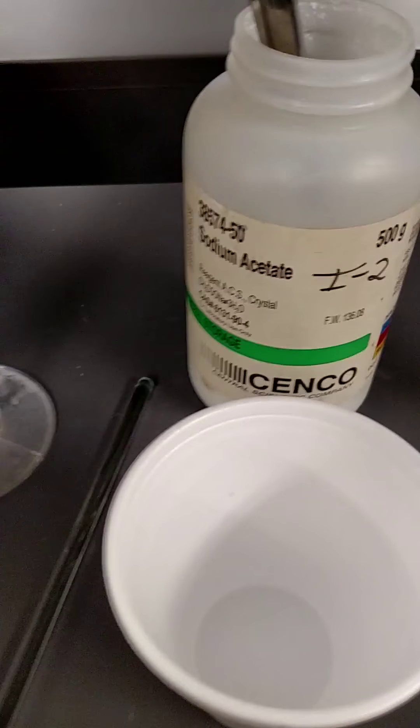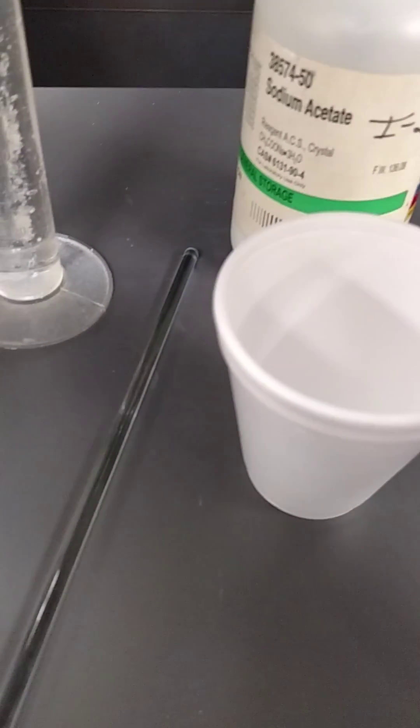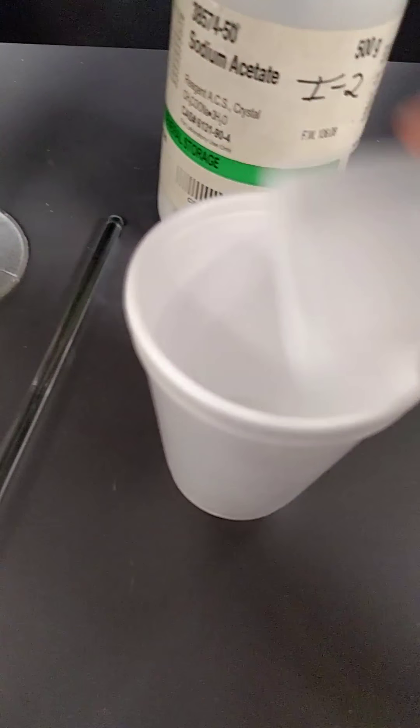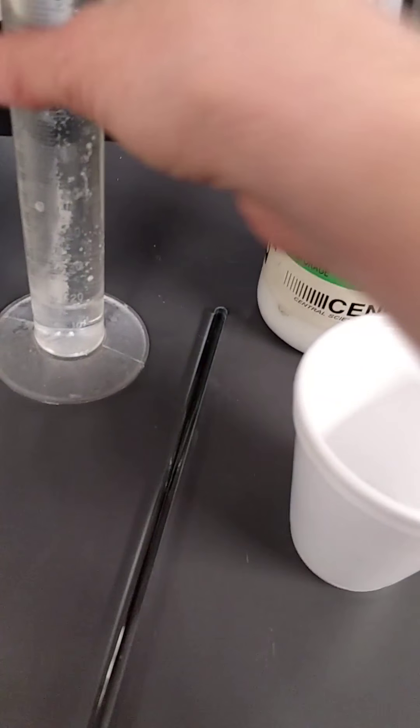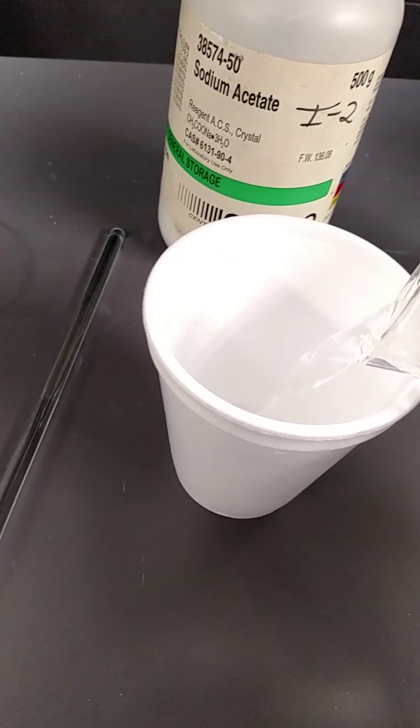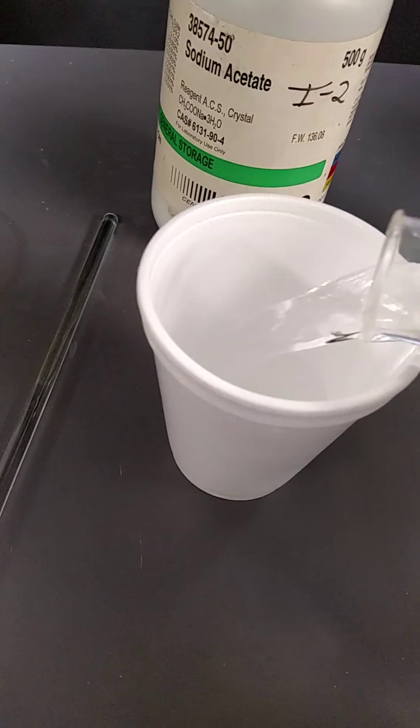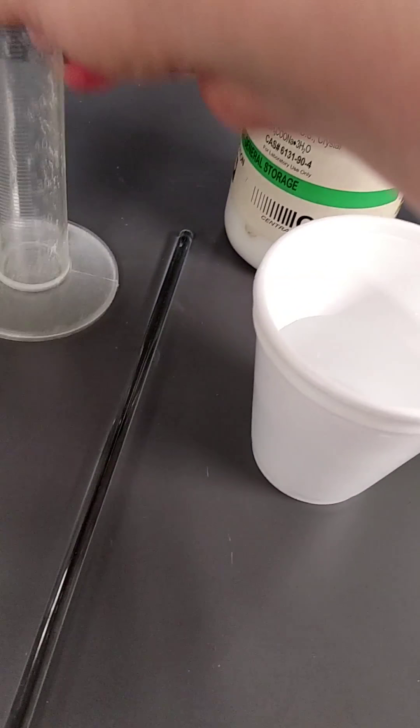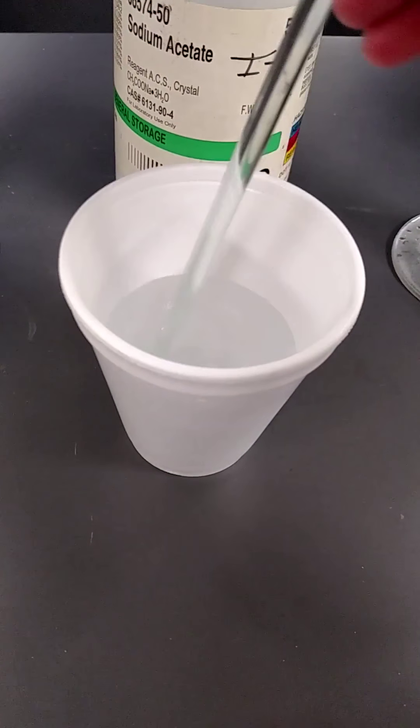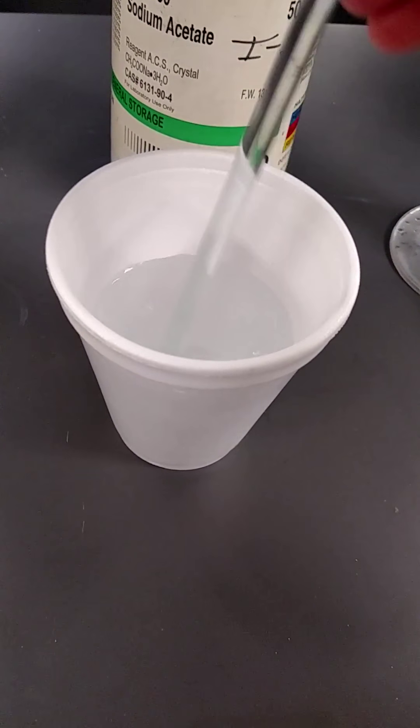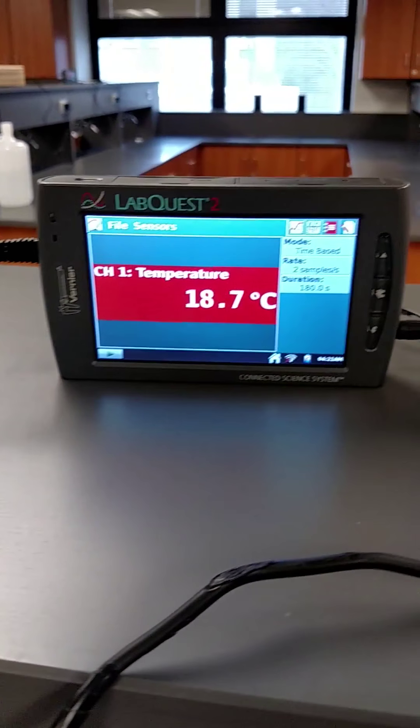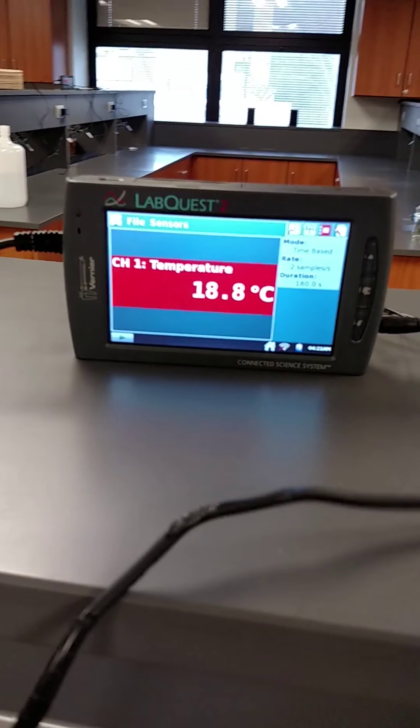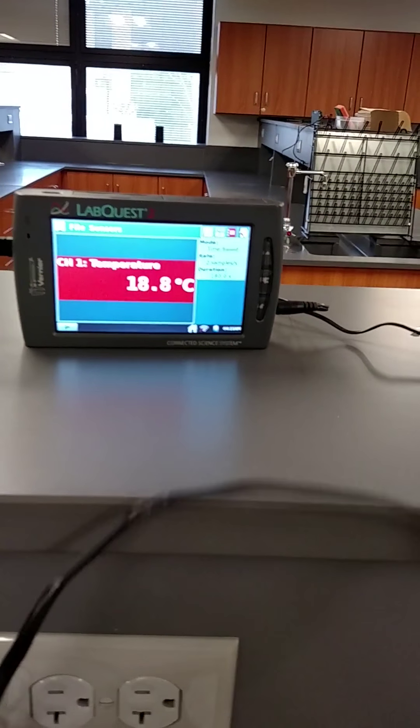Next, sodium acetate. There's my five grams, 100 mils. Give it a stir. Initial temperature, 18.8.